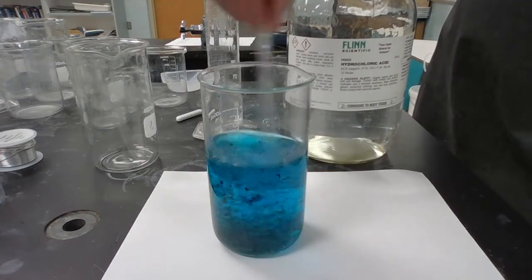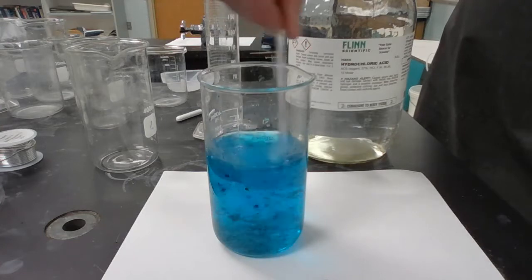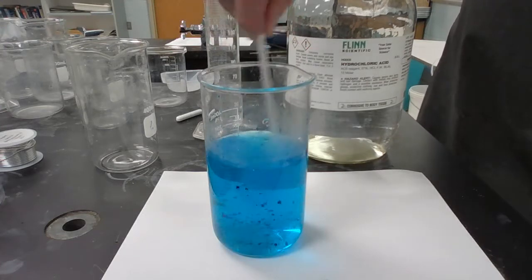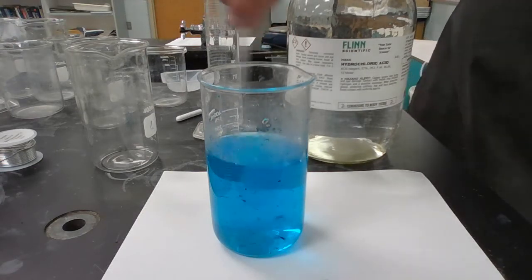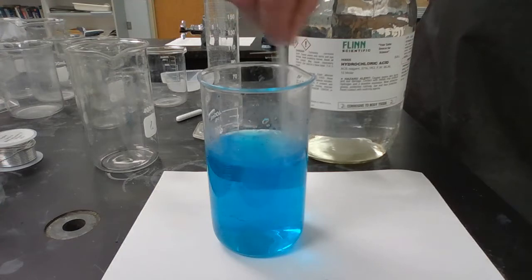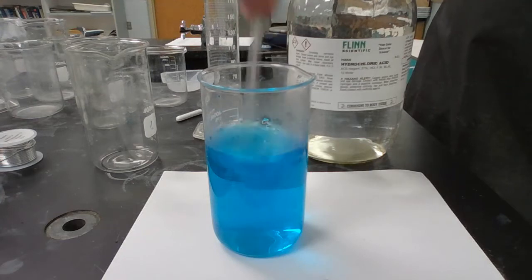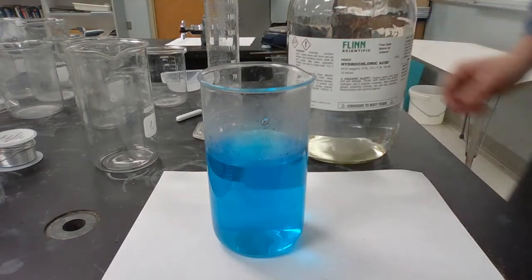Okay, so the acid's making it turn back to a nice clear blue color. All right, got it.